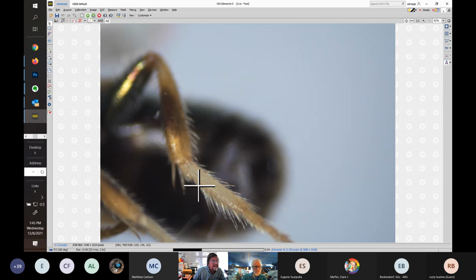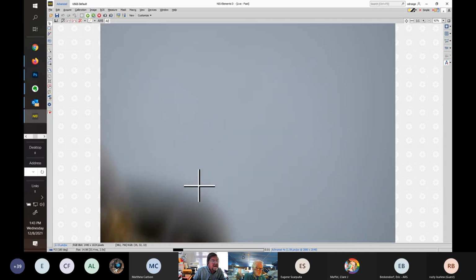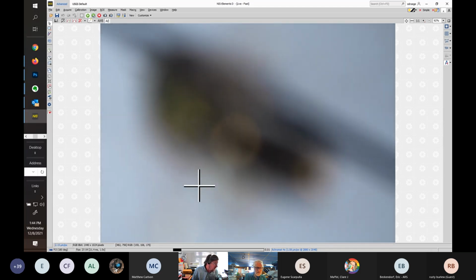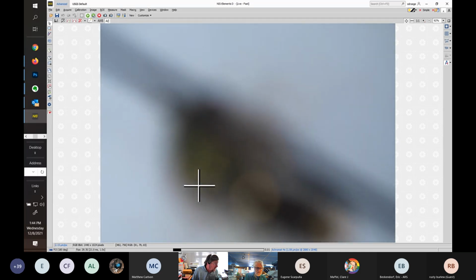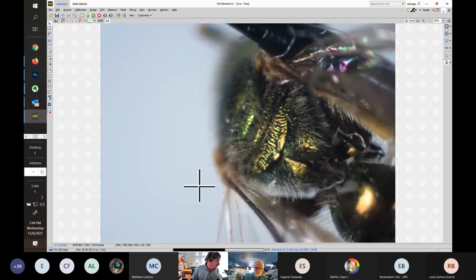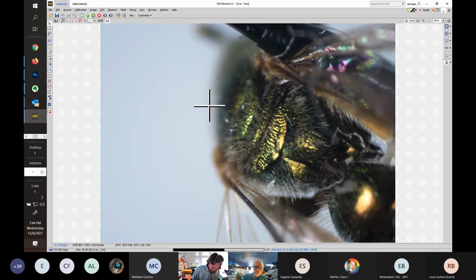But also in the males, the propodeal characters are usually there. I'm going to flip this specimen around and see if we can quickly see that. That's the key character anyway for females. And the more you look at it, the less mysterious it is, because when you read Mitchell, I was like, what is he talking about? Here's the striation. This is the propodeal triangle. These are the striations as per usual, and here are these bare areas. They're very small. And just to be a little bit confusing, almost always a couple of central striations go all the way to, let's call it, the rim.